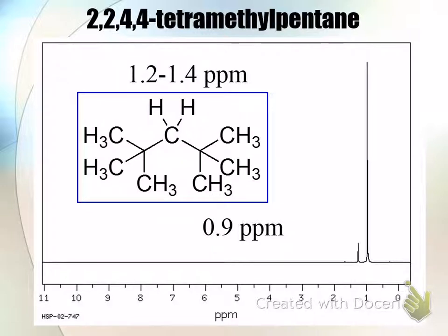So you can get the proportions of each type of atom in a structure by doing an NMR spectrum. Then if you know the empirical formula, you can actually calculate how many of each type of hydrogen you have. So if you know it's a 9-to-1 ratio, and you get the molecular formula, you can use that information to calculate how many of each kind you have.